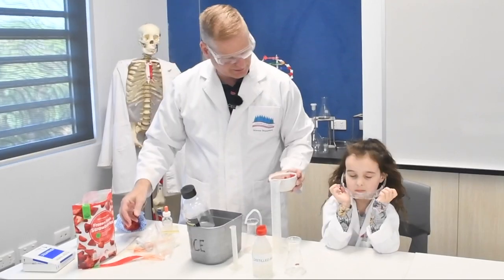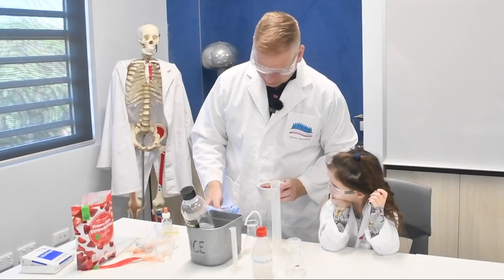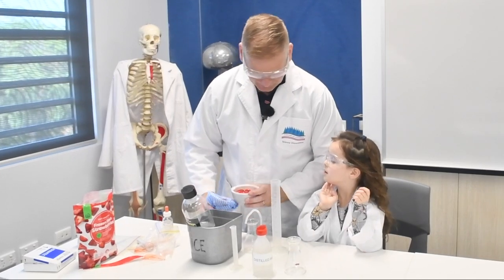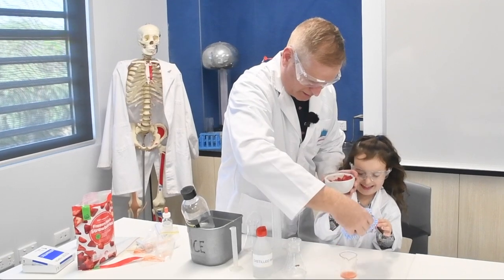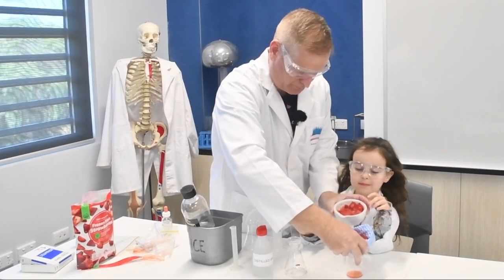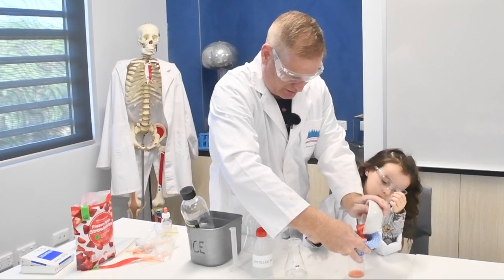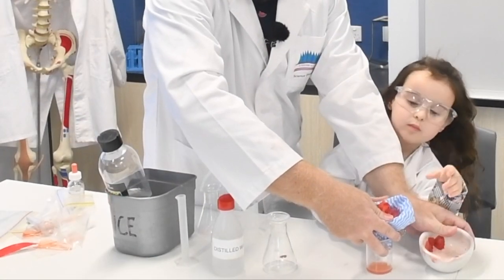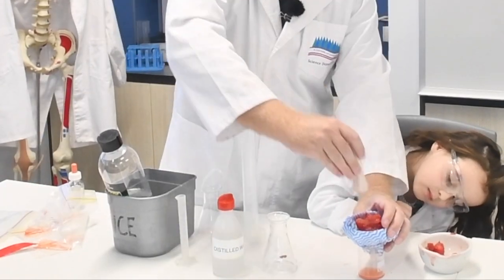no, your science glasses have to stay on, otherwise your eyes aren't protected. So what we're going to do is pour it into here. There's already a little bit from what we did before. So I'm going to pour this in there, and you got to tell me if the strawberry starts going into this beaker. So I'm going to mush it through a little bit.